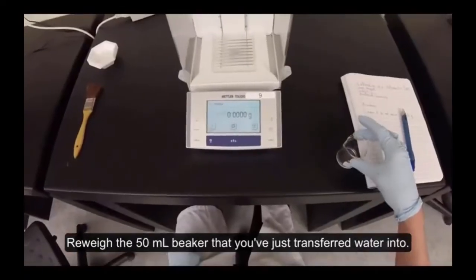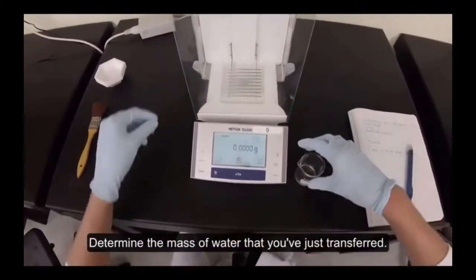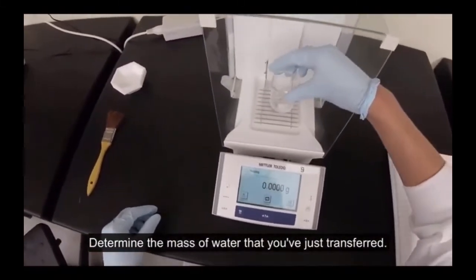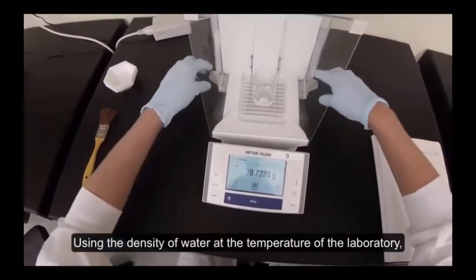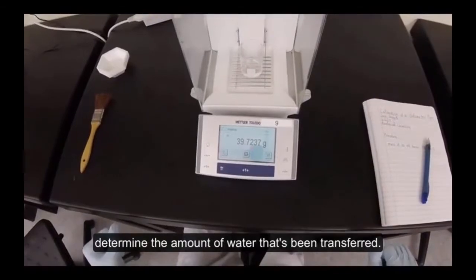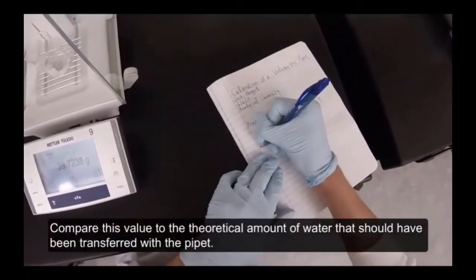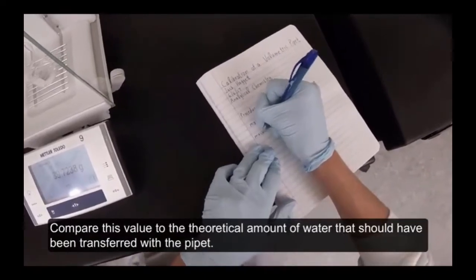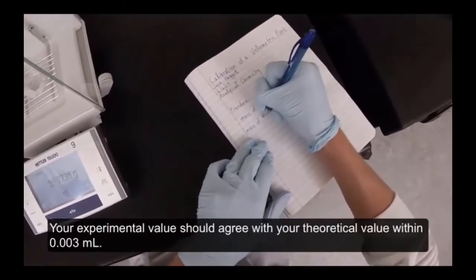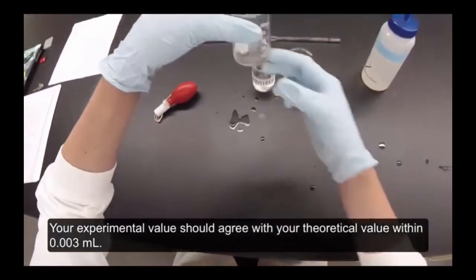Reweigh the 50 milliliter beaker that you've just transferred water into. Determine the mass of water that you've just transferred. Using the density of water at the temperature of the laboratory, determine the amount of water that's been transferred. Compare this value to the theoretical amount of water that should have been transferred with the pipette. Your experimental value should agree with your theoretical value within 0.003 milliliters.